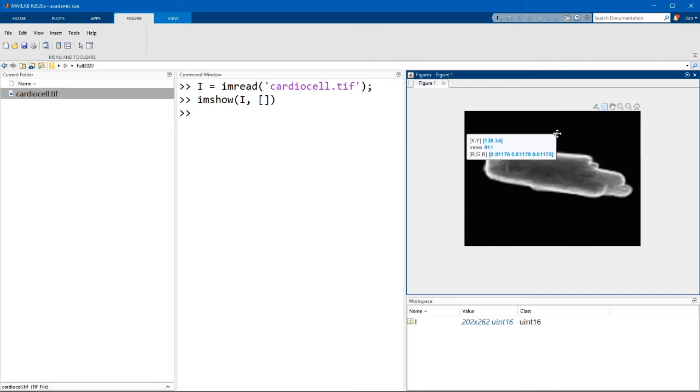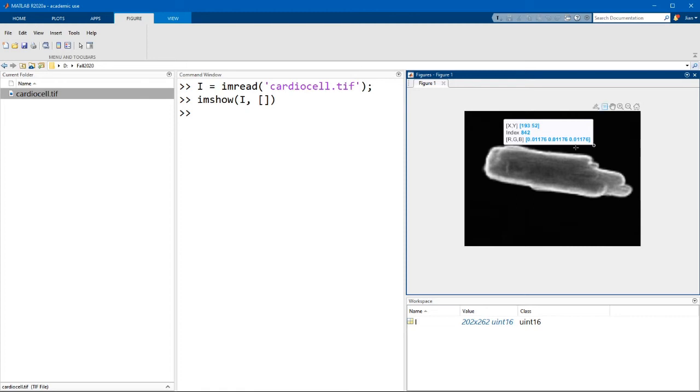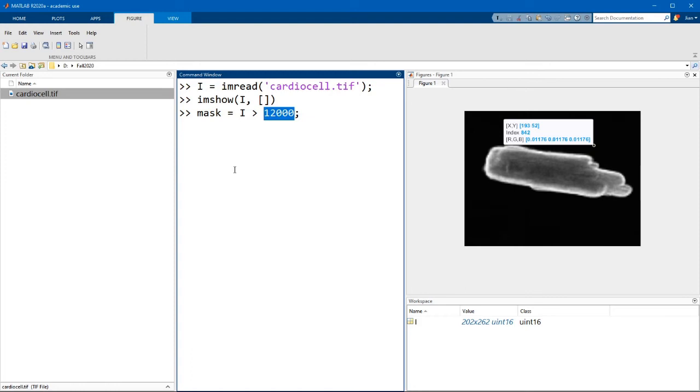If we look at the background, we can see that the background values are much lower than that, maybe on the order of 900. Okay, so going back to the command window, I can create a mask by simply using the greater than operator. Let's call this variable mask equals i greater than 12,000. This value of 12,000 here is called the threshold intensity.